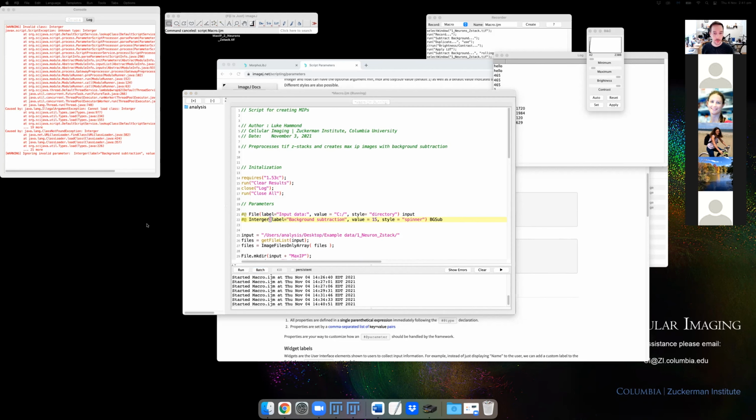Integer spelling. Oh, thank you. Yeah, that's right. So it's always typos.